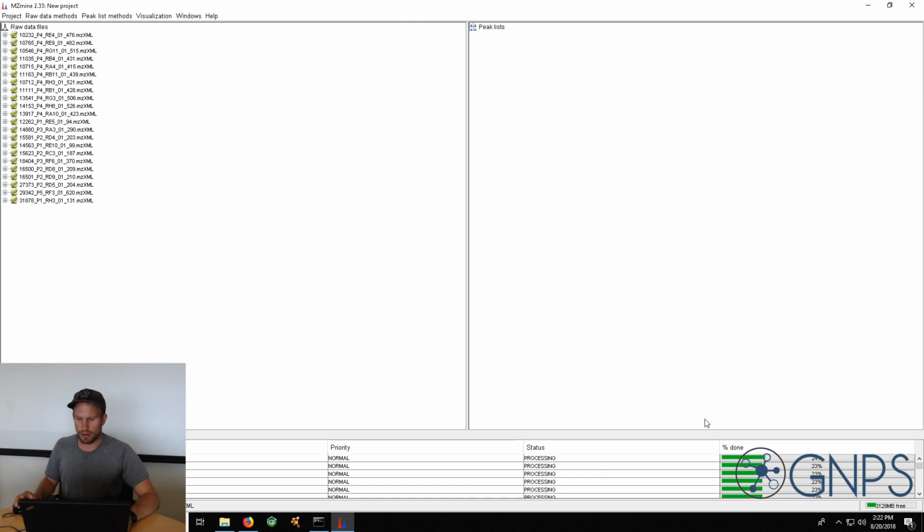As we have some more peaks here, you can see it already takes a little bit longer than before. Again, if you have many samples, you may run into scalability problems where it takes forever and eventually crashes, especially when you have hundreds or thousands of samples. So often the threshold also depends a little bit on the size of the data set you're dealing with.